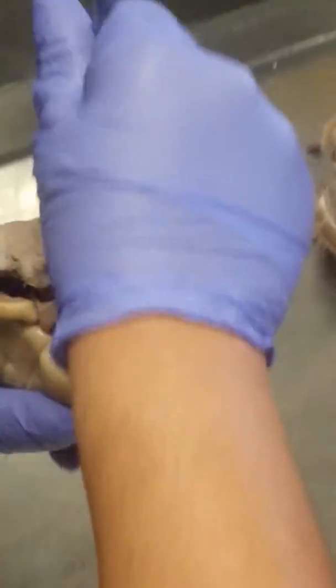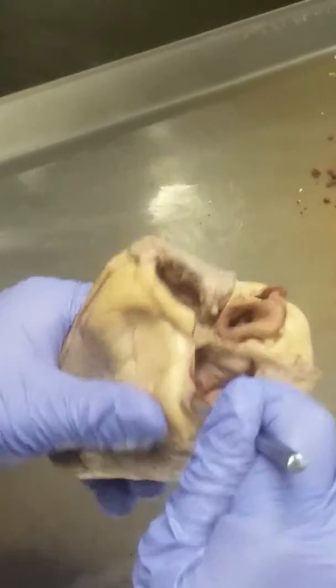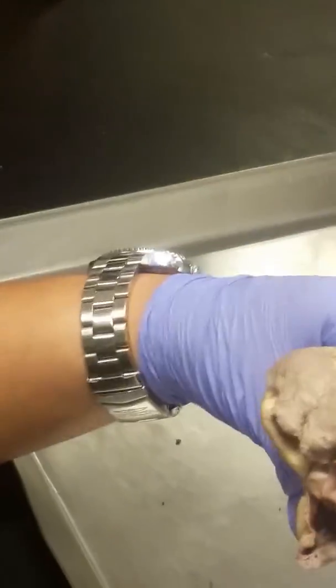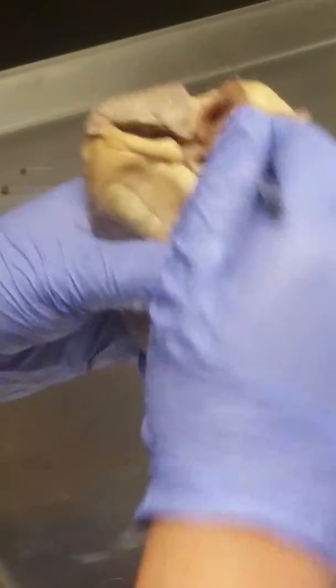Familiarize yourself with base, apex, pulmonary trunk, aorta, superior vena cava. What's this structure here? That's the left auricle, and this is the right auricle, right? And these are the atria, which is in here, and then you've got the ventricles.